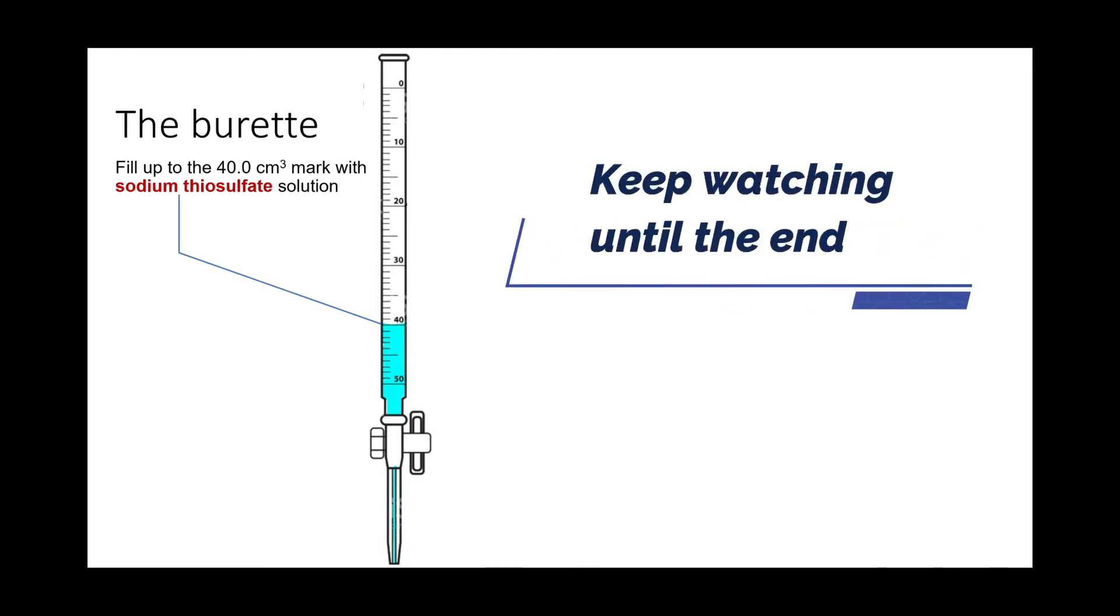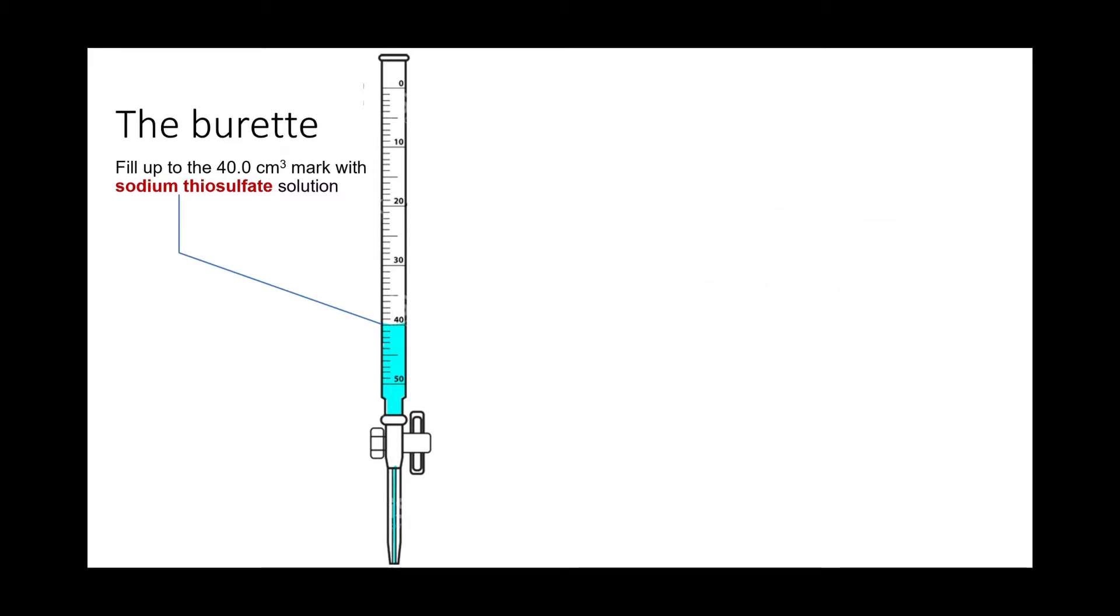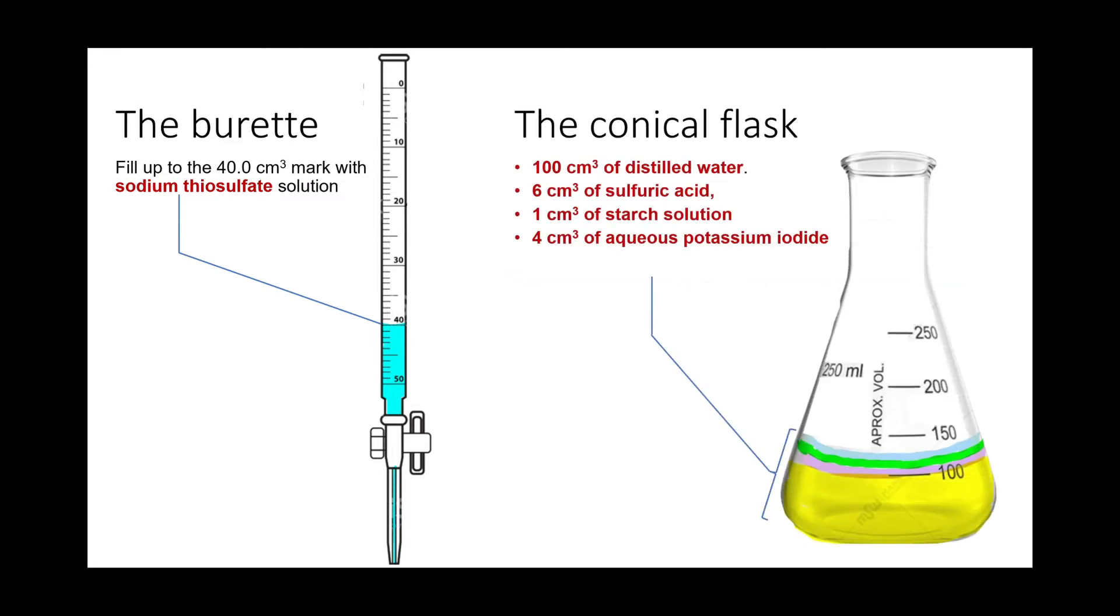So, we fill up the burette to the 40 cm³ mark with sodium thiosulfate solution, and then we prepare a conical flask and fill it up with the following solutions. The next solution we add is 1 ml of sodium thiosulfate from the burette, and then swirl to mix. Now, we are ready to mix in the hydrogen peroxide and start the timer. Once the timer starts, you cannot stop.